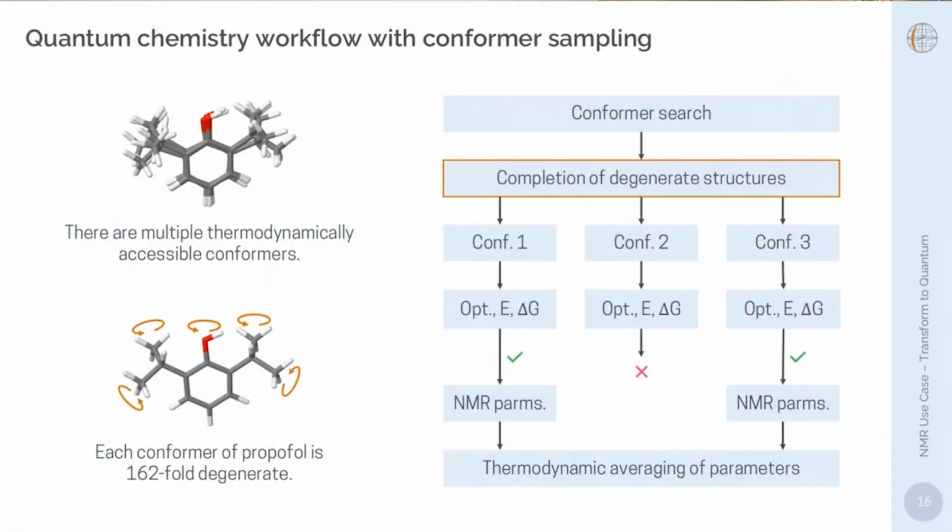So this is what we do. We have developed a workflow which uses the standard tool for conformer search. It optimizes the geometries of all the conformers, determines their energies, determines their NMR parameters, and so on. And of course, makes use of standard components. Yet setting up this entire workflow is a pretty complicated undertaking. So we've been working on that for about 2 years, and now we are getting pretty good results. Then you actually get parameters that are realistic, as you will see.